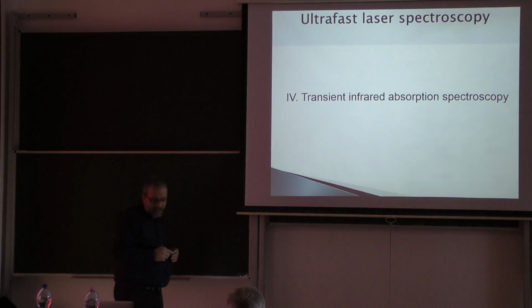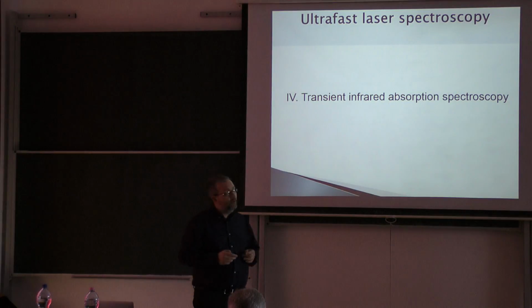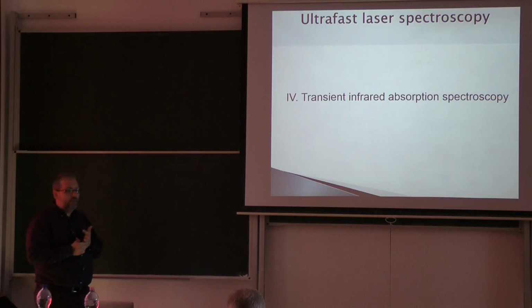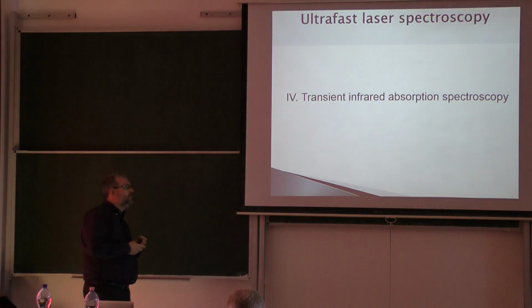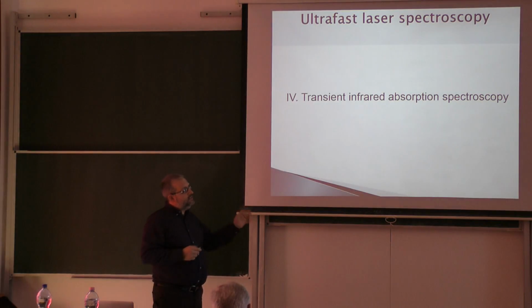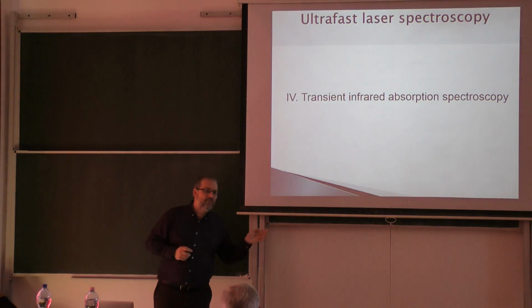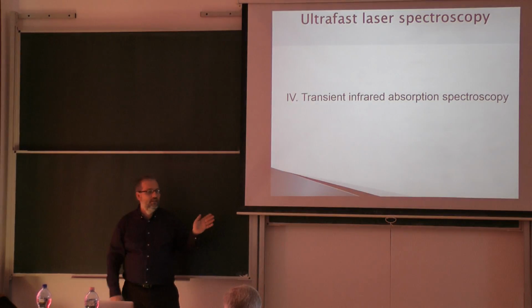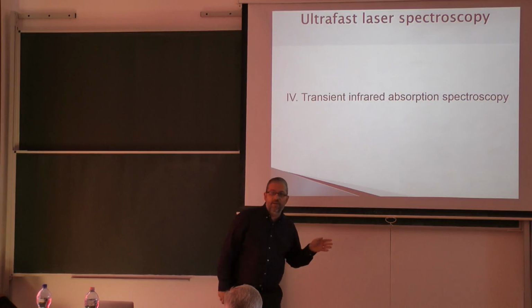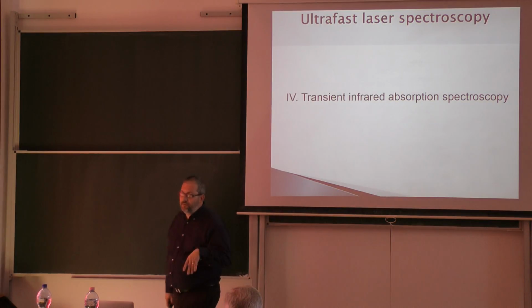Now, of course, it can be a subcase of transient absorption, but it's different from the visible absorption, of course, the infrared absorption. And this is much more difficult to do. I would say that you cannot do it in your lab, only if you have a lot of money, transient infrared absorption.